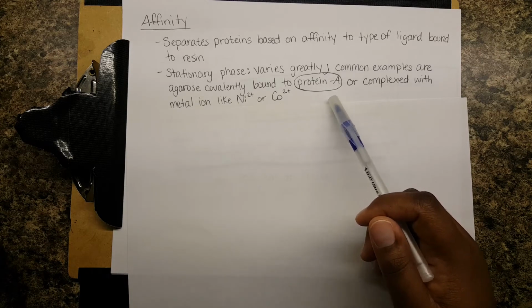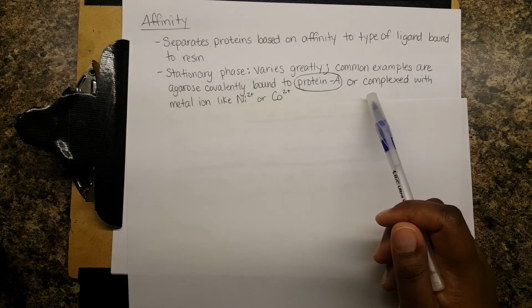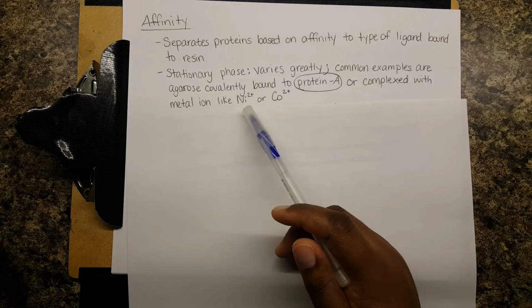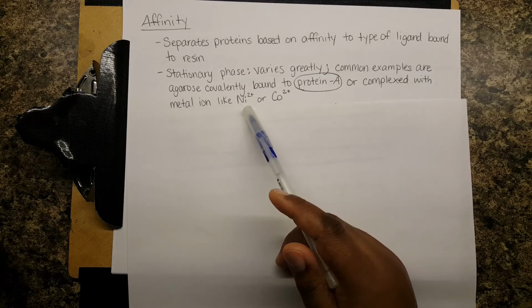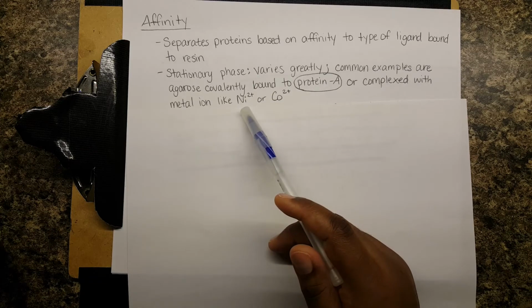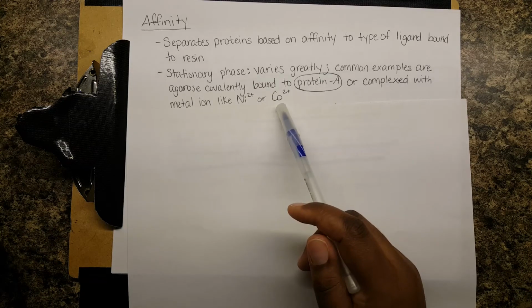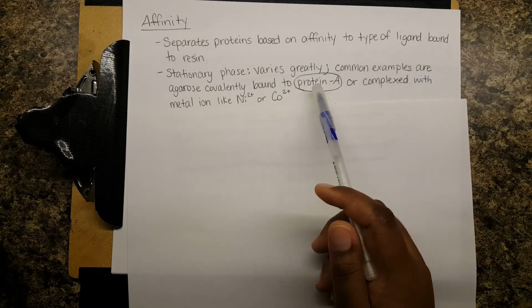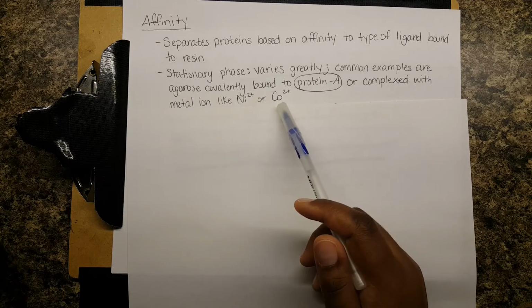You can also use immobilized metal affinity chromatography, or IMAC, and that's where you use a metal like nickel or cobalt. The nickel is a pretty blue color. The cobalt is like a pink color. And your protein will interact with the metal, and it'll hang on to the metal, and everything else will flow through. That's not quite as specific as, say, using protein A, but it still works quite well.